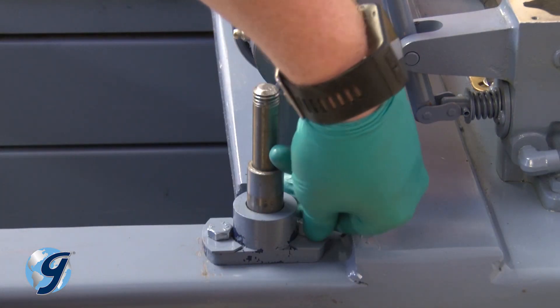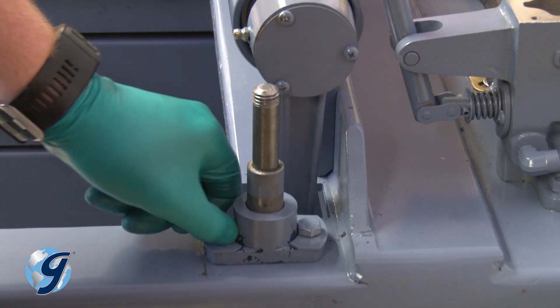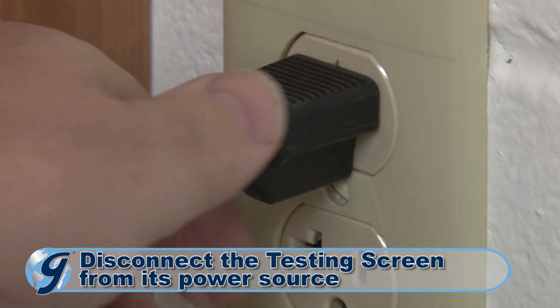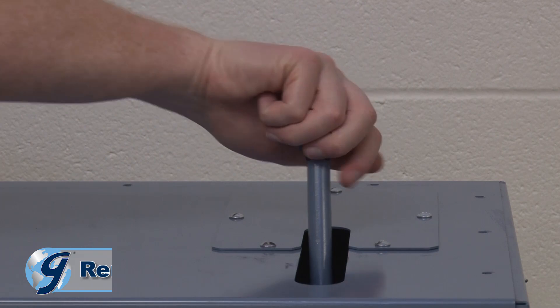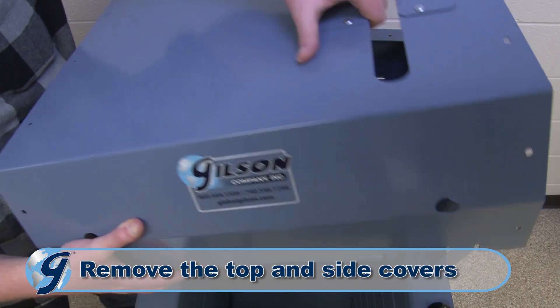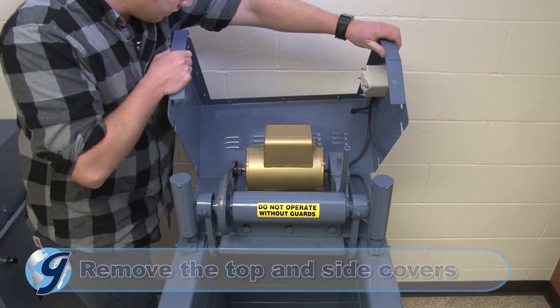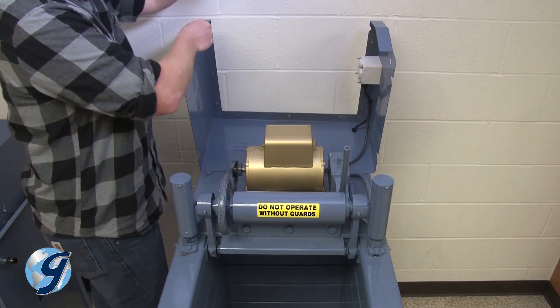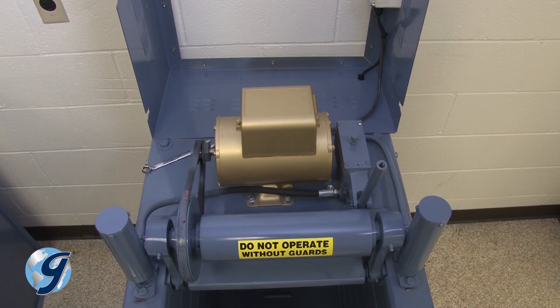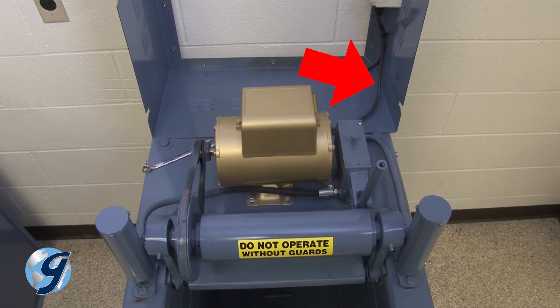To inspect the hydraulic clamp rod assembly on your Gilson testing screen, you first disconnect the testing screen from its power source. Remove the pump handle grip. Next, remove the top and side covers to the machine and safely set them aside. Note the short load line to the electronic controller.